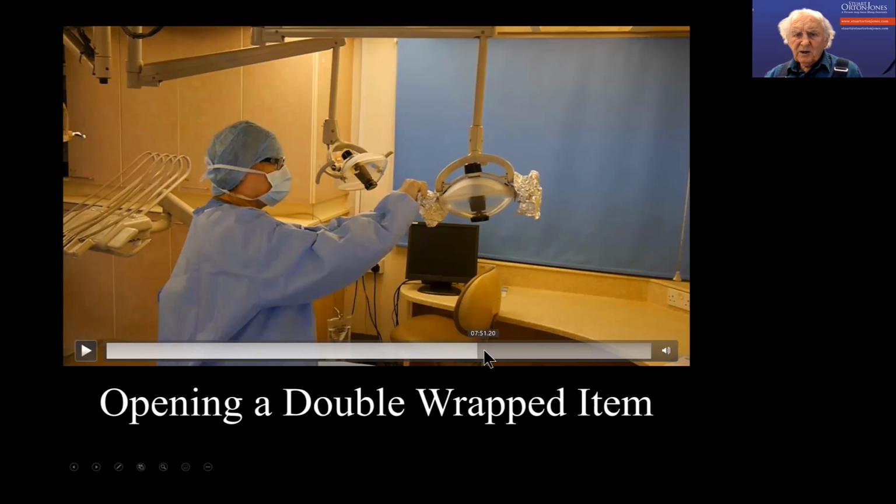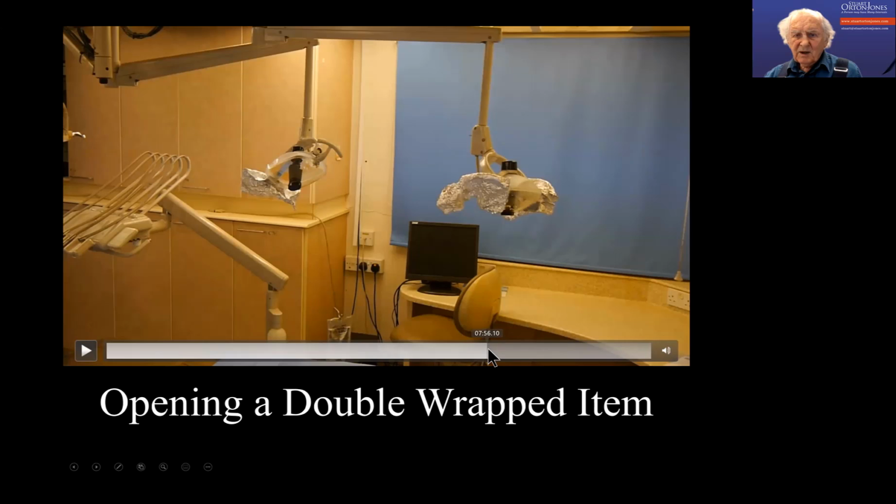So this is putting the tinfoil on, which, as I mentioned to you, has the advantage you can hear it when you contaminate it with your head.